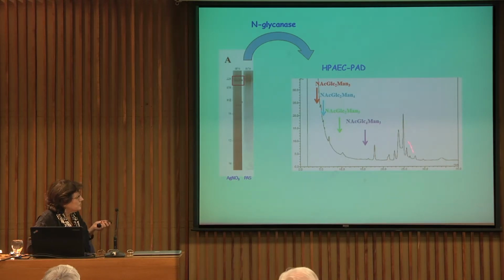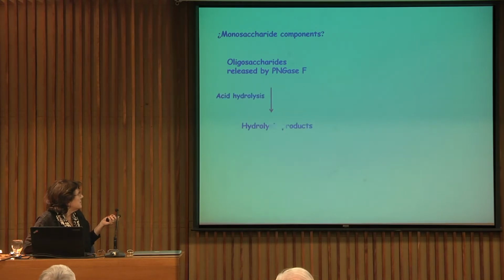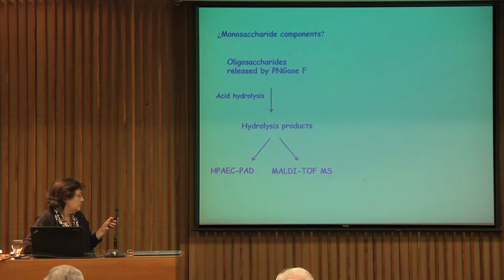So we first took this mixture and looked for the monosaccharide components. When we made acid hydrolysis, the hydrolysis products were analyzed by anion exchange chromatography and also by MALDI.